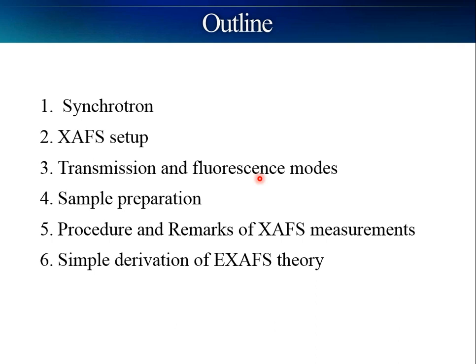Before taking such an experiment, we carefully prepare the sample, so I want to explain how to prepare the sample. A simple procedure of XAFS measurement will be introduced, and I will suggest important remarks of XAFS measurement to get good data. Finally, the XAFS theory will be derived from a simple idea.